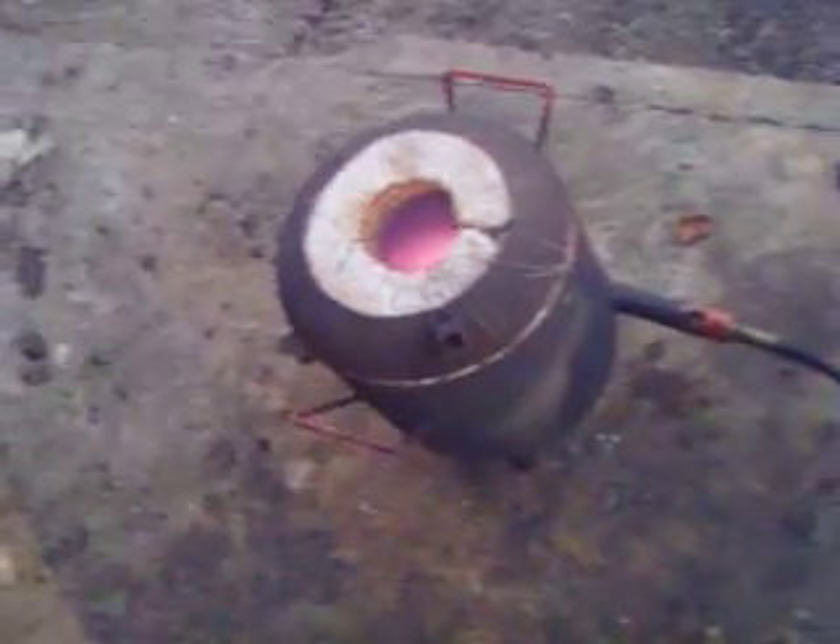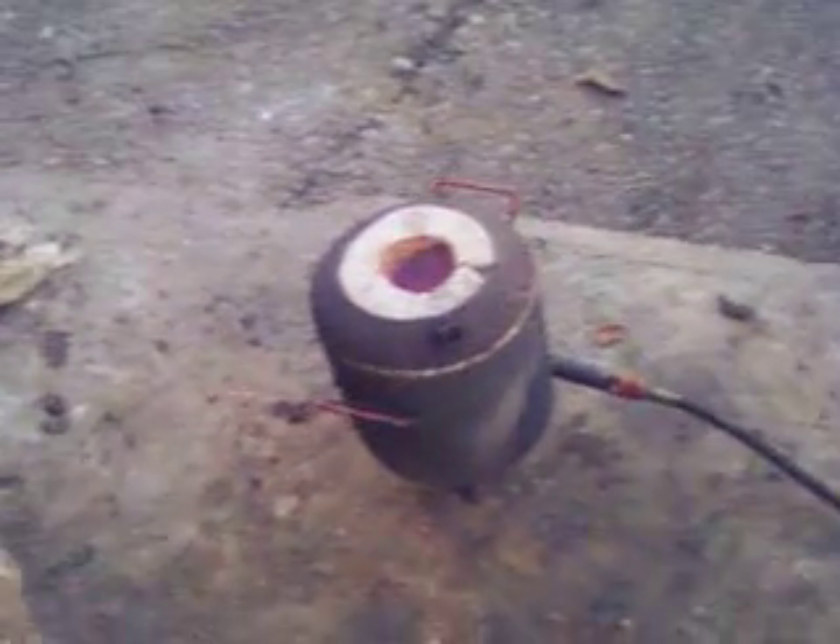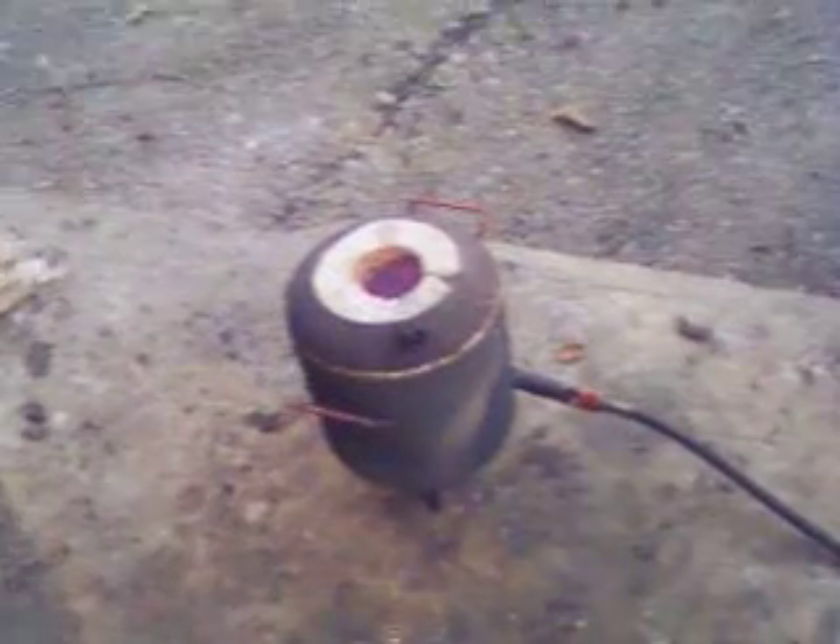The bright spot in the center is actually the molten lead. I'm going to let that go until the lead pool is the size of a dime, then we're ready to pour it off in the mold and let it cool.